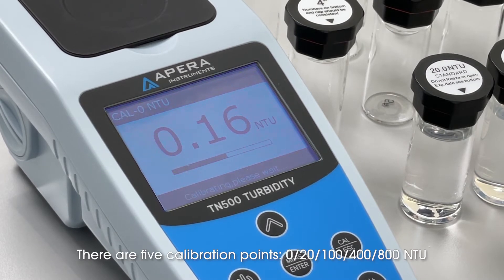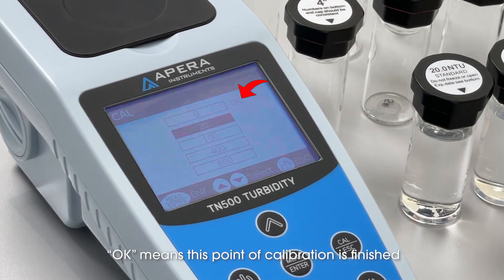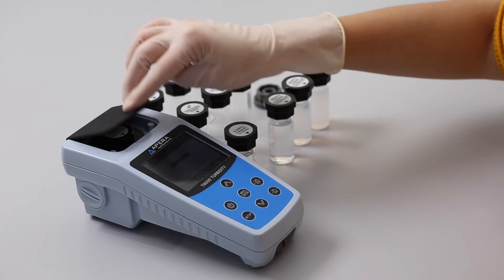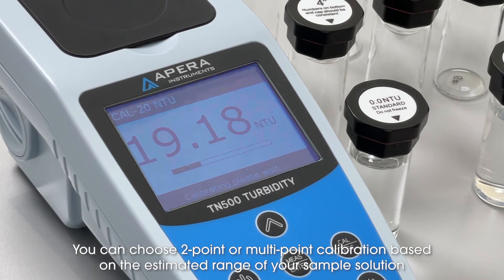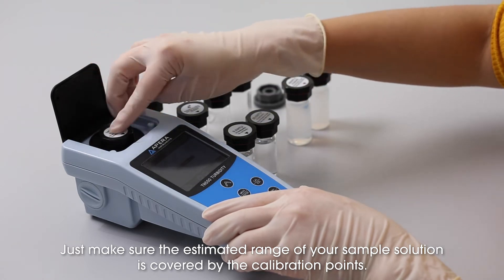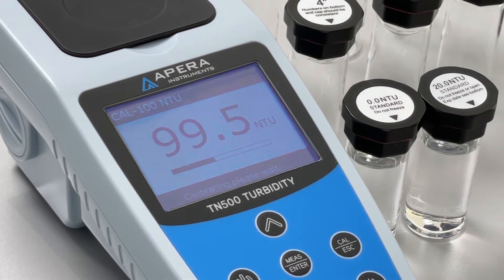There are 5 calibration points: 0, 20, 100, 400, and 800 NTU. OK means this point of calibration is finished. You can choose two-point or multi-point calibration based on the estimated range of your sample solution. Just make sure the estimated range of your sample solution is covered by the calibration points.